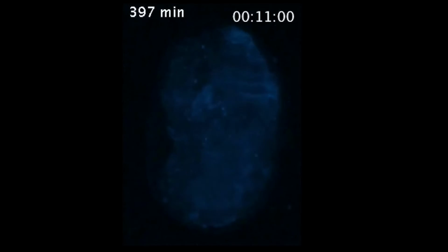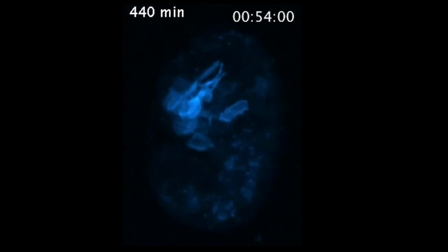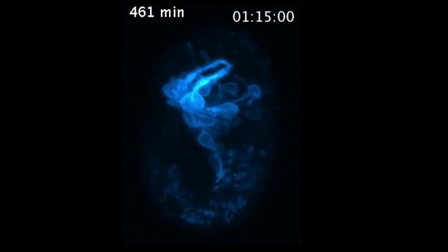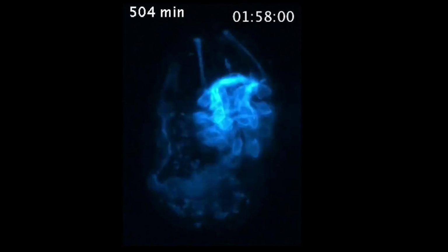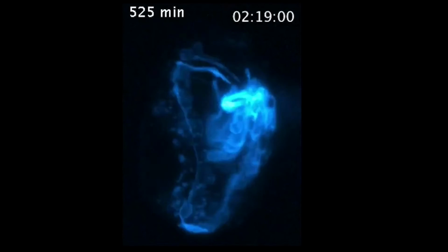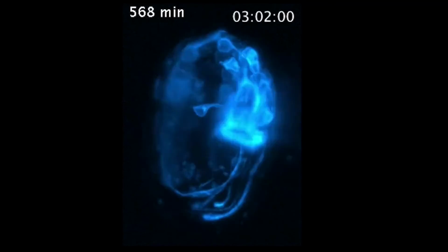So you can look at these single neurons and their decisions in the context of the developing brain, which we think is really cool. When a neuron grows out, its ending is very dynamic, so you would see certain structures forming, and there are points where you can see the neuron making its decision. So when a neuron is initially growing out, you can see that there are small extensions that are forming, and then one of them goes on to become the final extension or the axon, and so you can actually see those decision points.